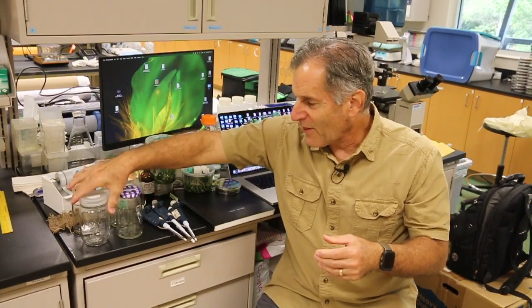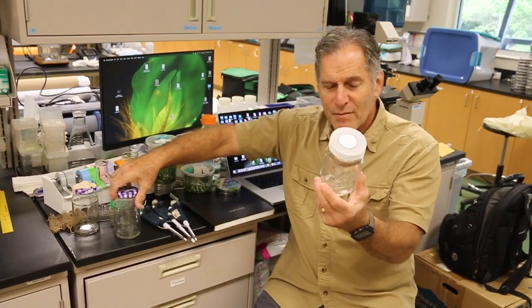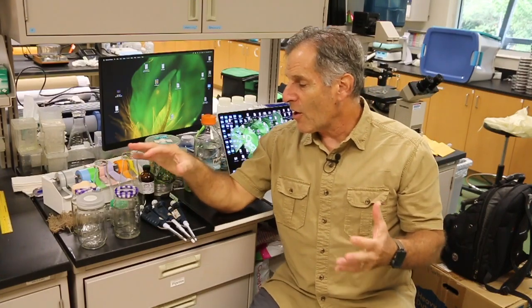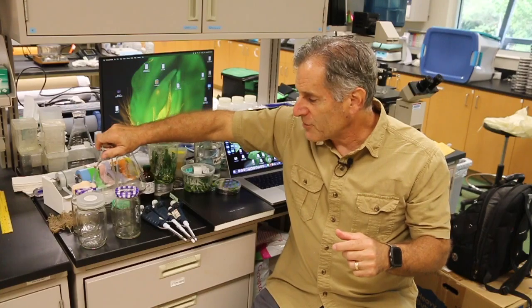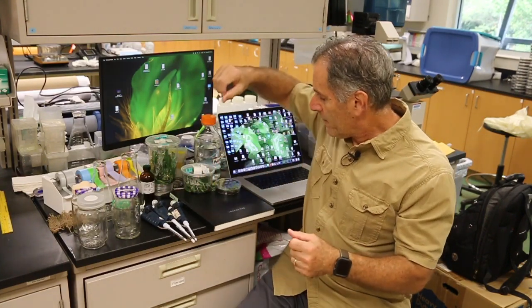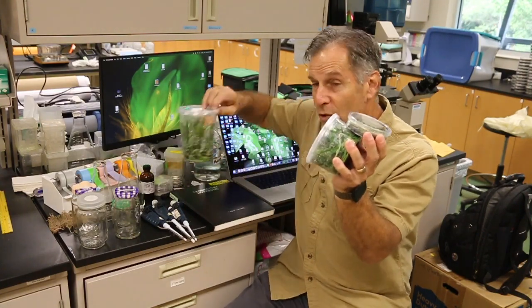And then the flasks were further modified. Again, another glass container right here. And this is a mason jar that has a special lid on it for breathing. So these again are the types of flasks. Started out in these standard Erlenmeyer flasks here, and then people were using glass flasks, glass test tubes, things like that. Now what people use in the laboratory for flasking are this container or this container or this container.